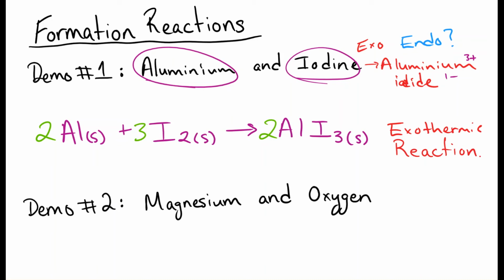Okay, let's move on to the second demo. Now, the second demo is a reaction between magnesium and oxygen. It's a pretty quick video. Let's go ahead and watch the video, and then we'll talk about whether it's endothermic or exothermic, and we'll also write down the chemical reaction.